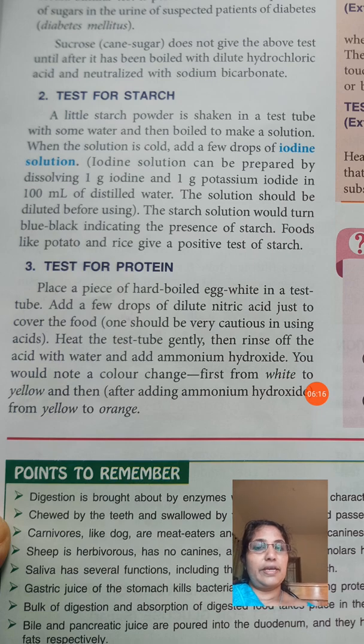We can take a hard boiled egg piece. Then add a few drops of dilute nitric acid. Dilute nitric acid has a light yellow color. Just to cover the food. How much we should take? Just to cover that piece of boiled egg.